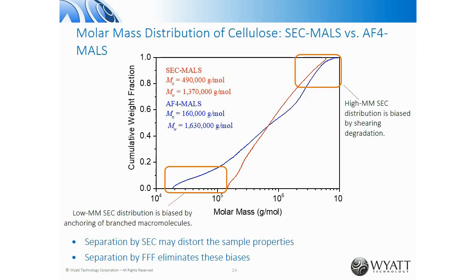That compares distribution curves of the same sample obtained by SEC in red and AF4 in blue.